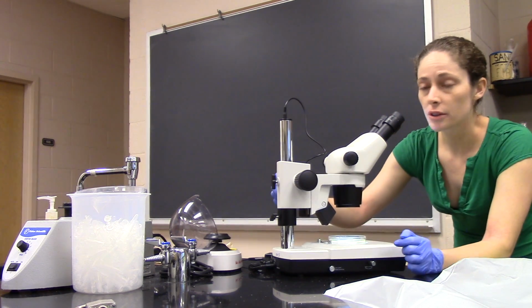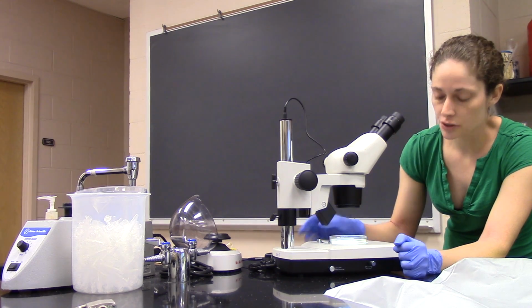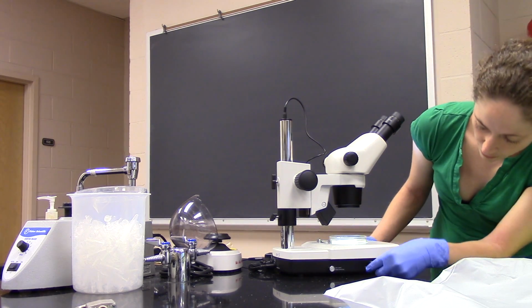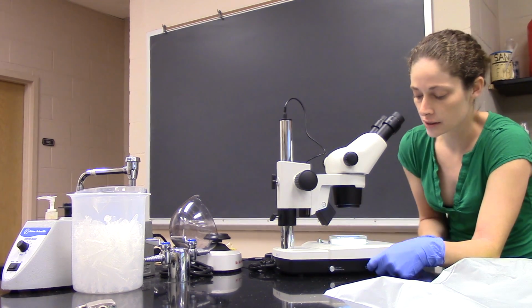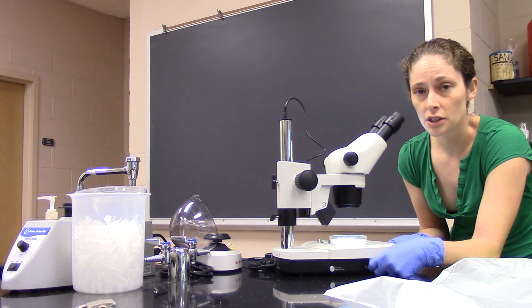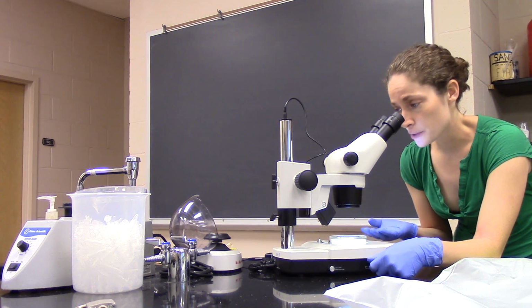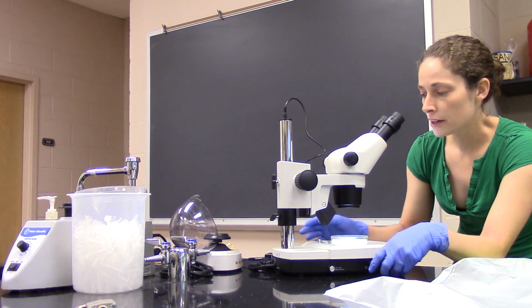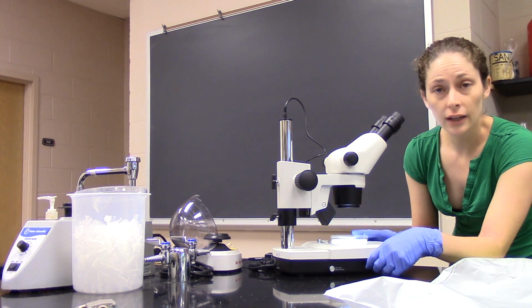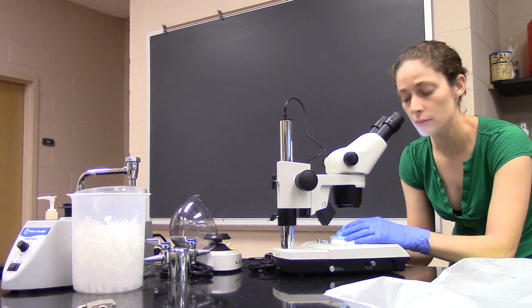All right, so I should be able to find some worms here. If you're having trouble, you might want to try adjusting the light levels or adjusting this knob, which is the mirror reflector that's underneath here. Okay, so adjusting the angle that that light is being reflected back can also help you find those worms a little easier. All right, so play around with the light intensities, the angle of the mirror, etc., until you're able to clearly see your worms.